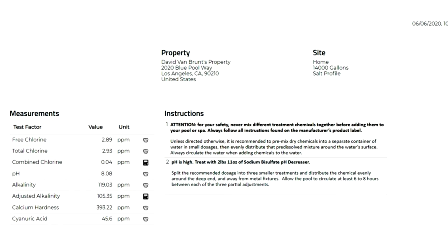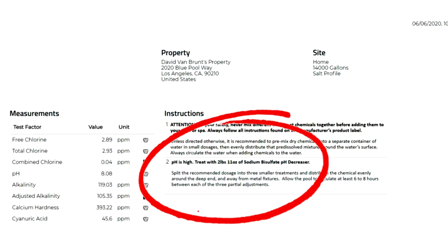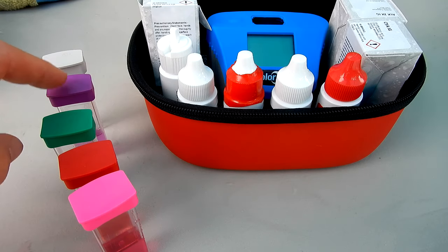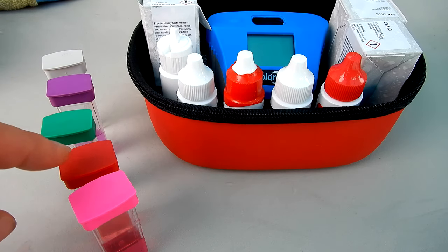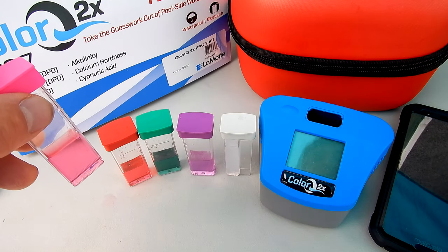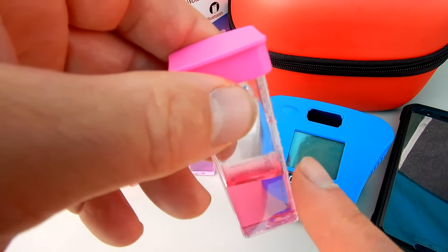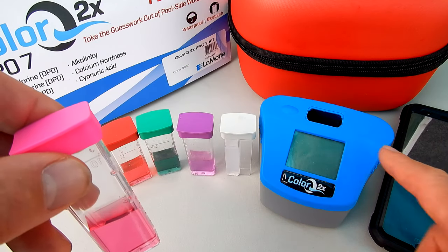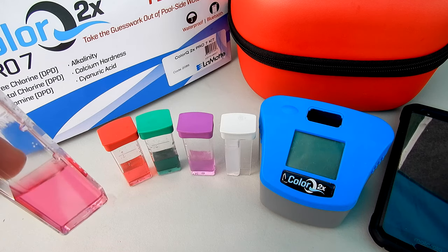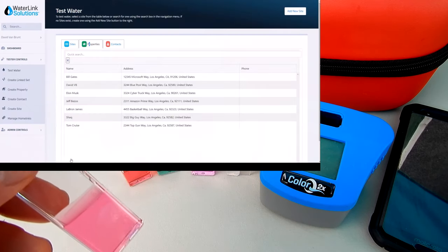I really like the printout of the WaterLink Solutions Home — it gives you not only the readings but also recommendations on how to balance your water. I like the improvements of the color-coded caps so you don't make any mistakes or cross contamination with the reagents. The ColorQ 2X Pro 7 would be a great choice for a digital pool water test kit. There's no need to read the colors of the reagent as it gives you a digital readout, and I like the fact that it connects very easily to the app to give you readings you can email to yourself or to clients on your route.